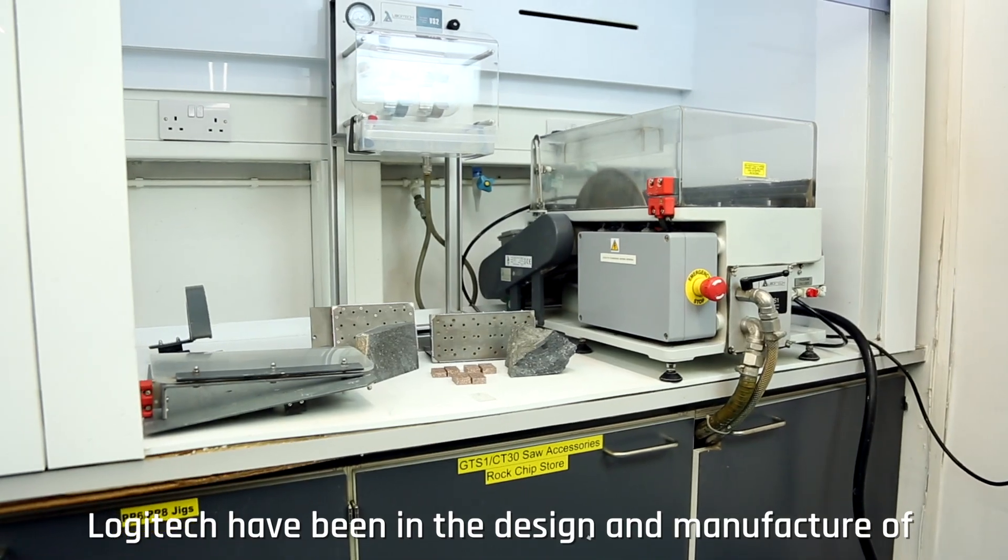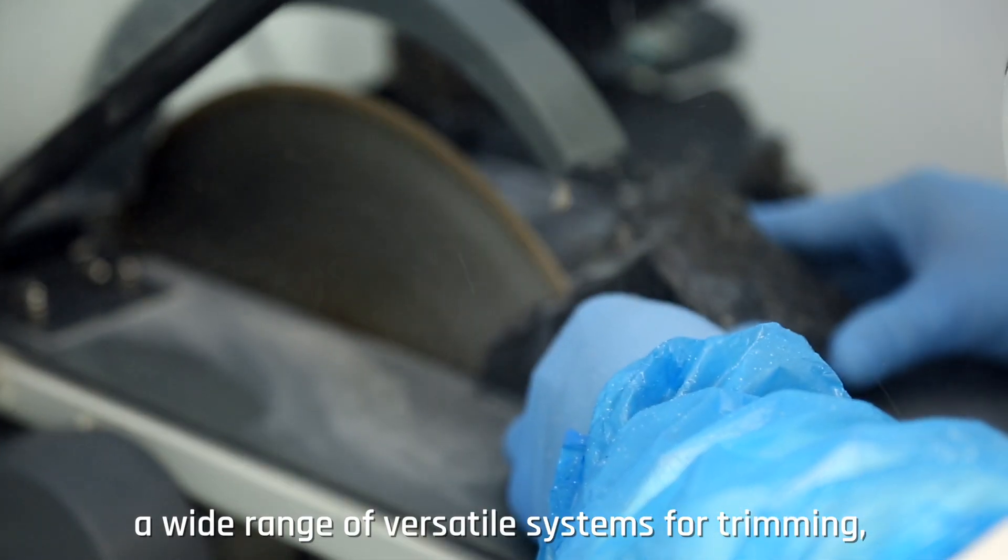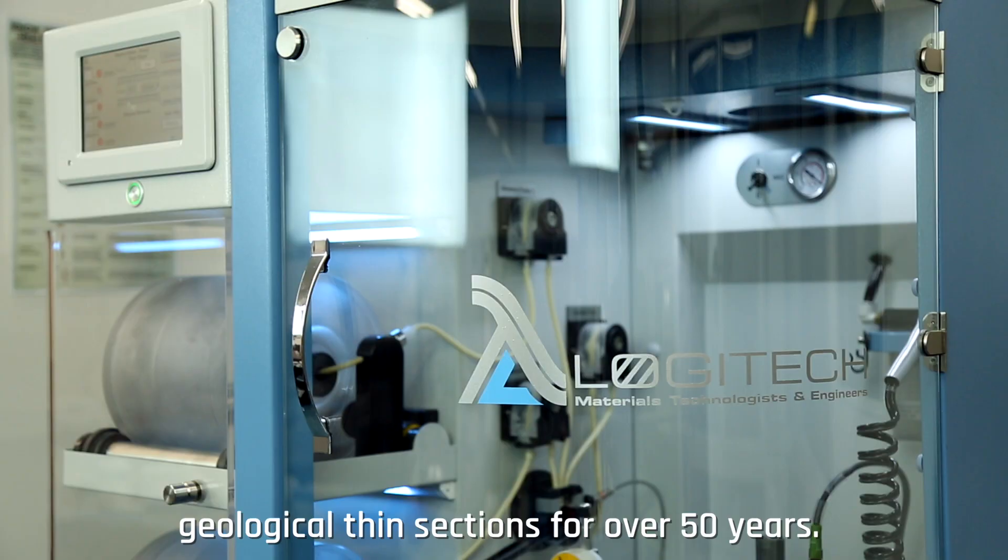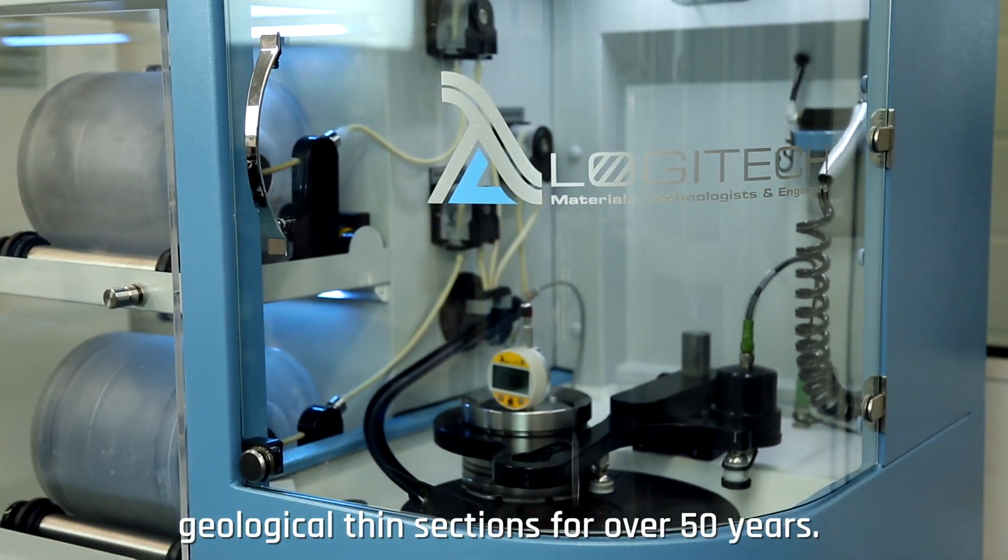Logitech have been in the design and manufacture of a wide range of versatile systems for trimming, lapping and polishing in the preparation of geological thin sections for over 50 years.